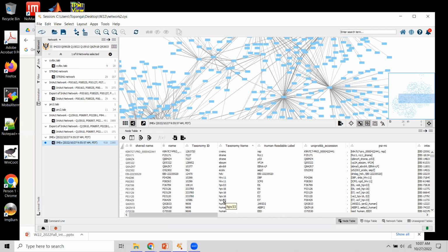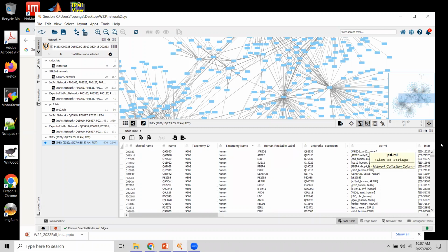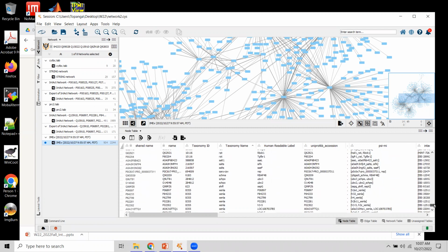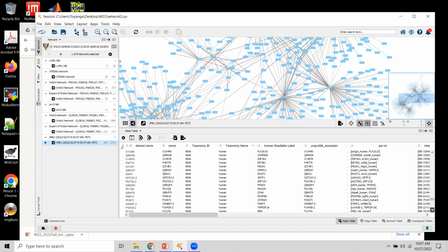I'm gonna remove all the things here, same drill as before, and now select from, okay, so everything before human is gone, and then we go down here, and there's more interesting things.